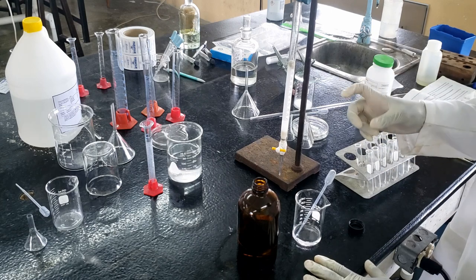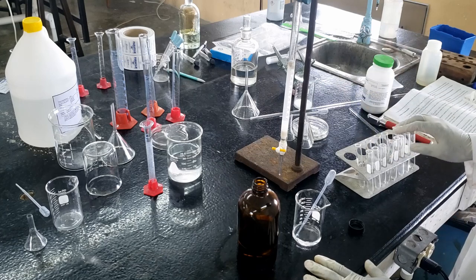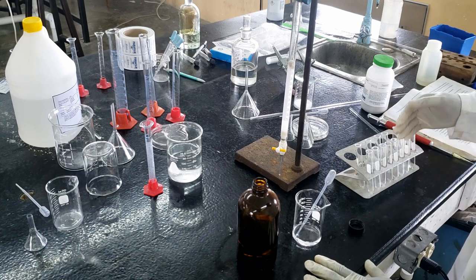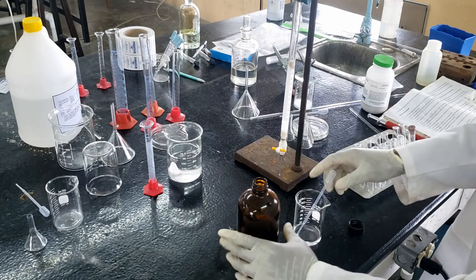So the test that we'll do is the same TLC plate test that you've seen before. So about every five fractions, or every five test tubes, we're going to stop, test with a TLC to see if we have product in that fraction. And if not, then we're going to continue.